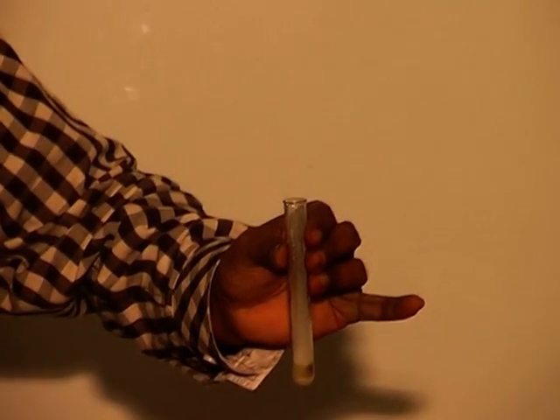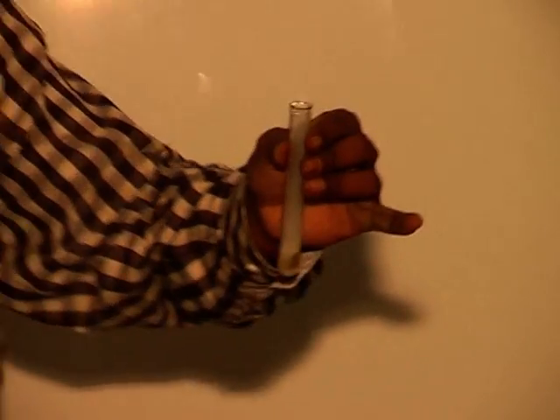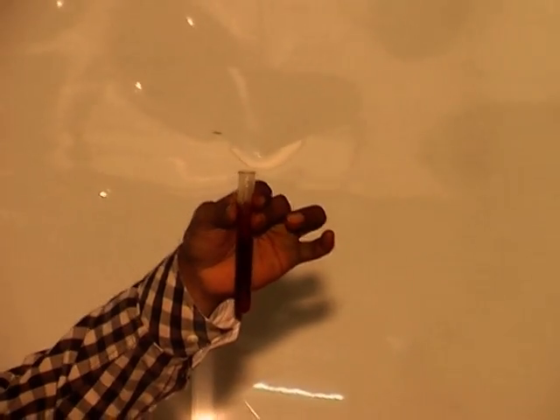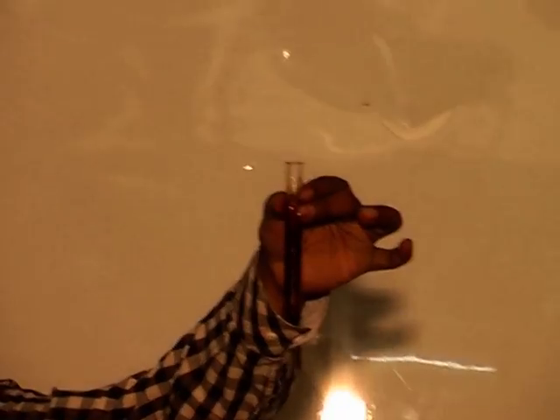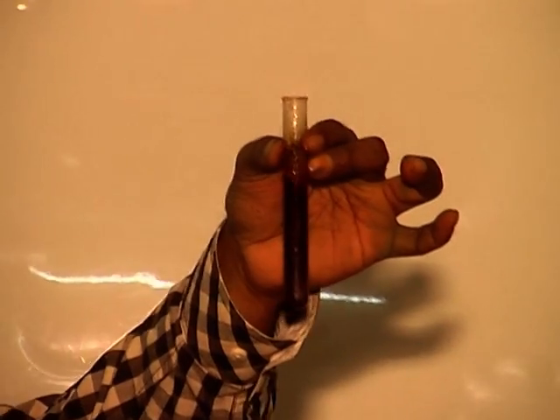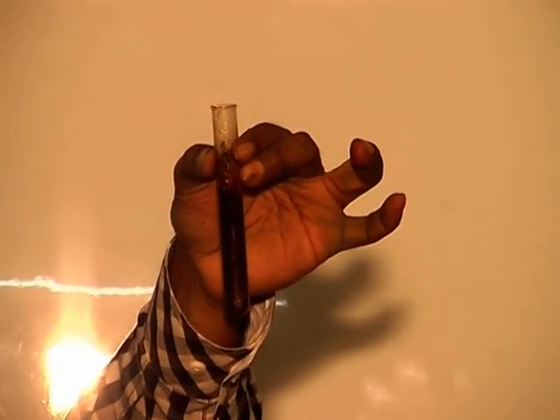After adding a small quantity of concentrated HCl, I am adding sodium nitrite crystals to this. Now a blood red colored solution is formed immediately after adding the sodium nitrite to that HCl and aniline. This is called a diazotization test.